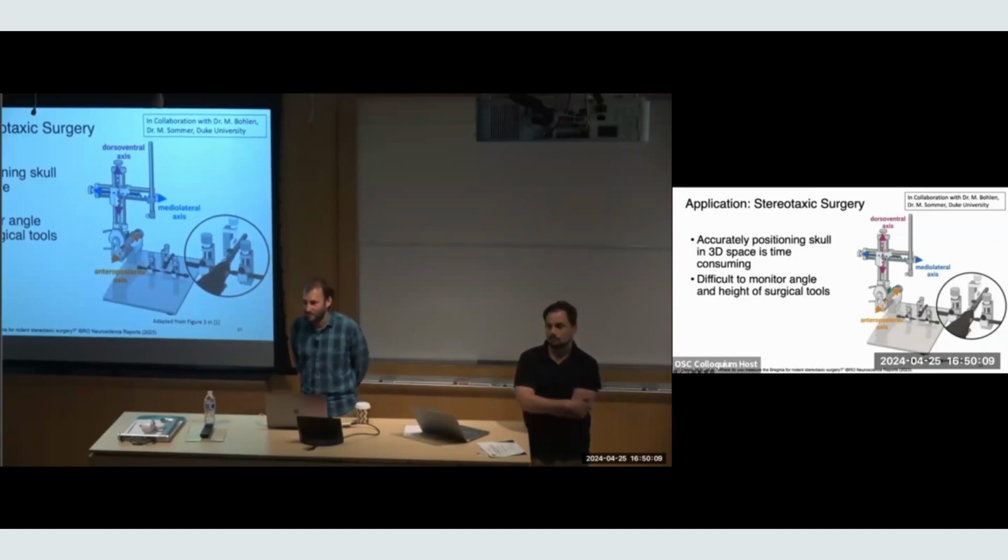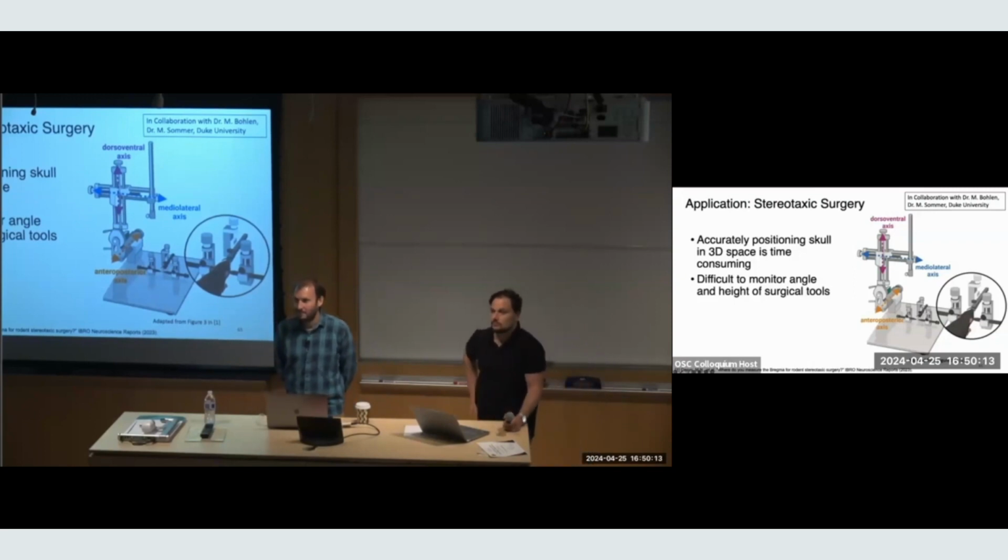So, in a few of your imaging systems, especially that 3D one near the end, you mentioned that you had some effects with your imaging system that actually did have an effect on the zebrafish behavior. And so, I guess, how do you know that you have an index card sized imaging system at the beginning? How do you know that it's big enough and that it's not affecting the zebrafish?